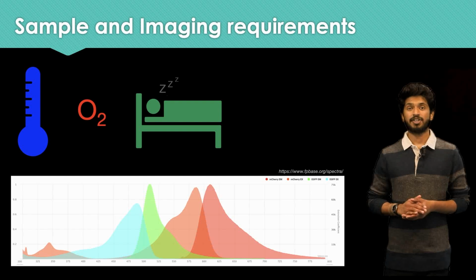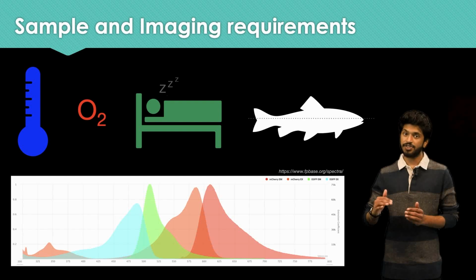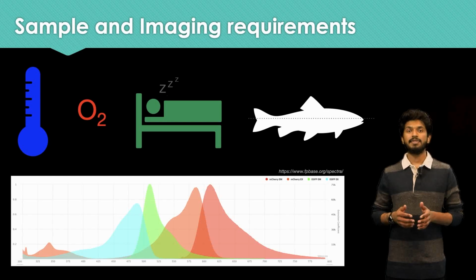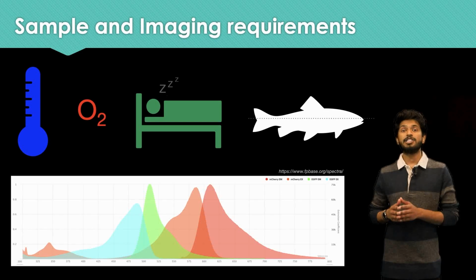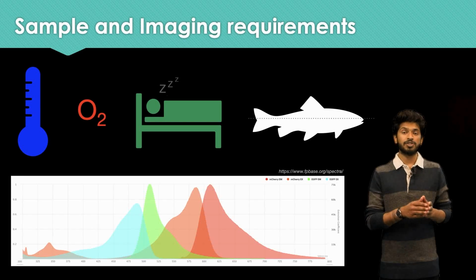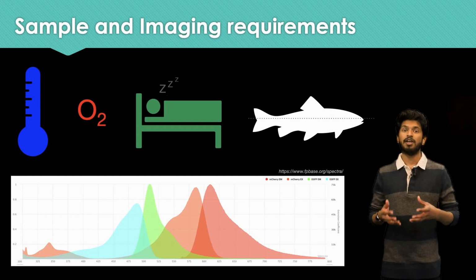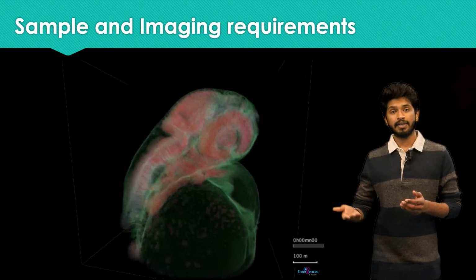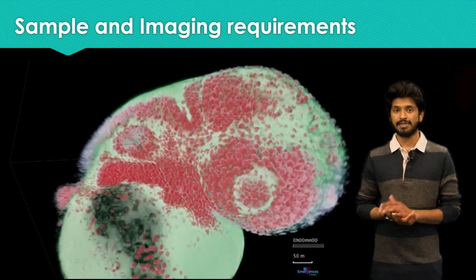We should also take into consideration if the image needs to be taken in depth or Z to reconstruct the image in 3D. Once this is considered, the time taken to image changes with the use of different setups, and it needs to be checked if this is optimal to see the expected event or if a time lapse needs to be taken to observe this event on the image. The image could be later rendered in 3D to understand it clearer and observe this better.